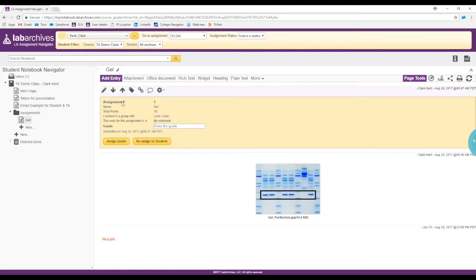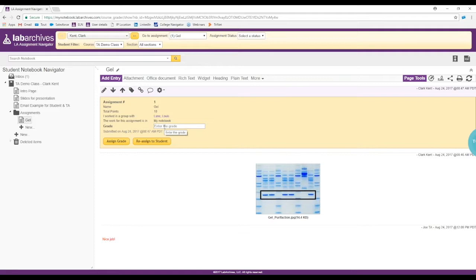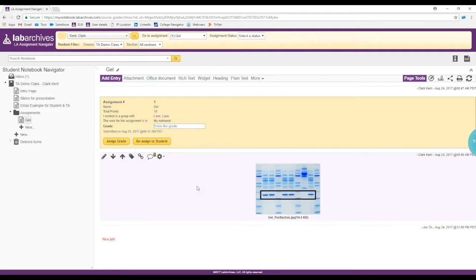This is assignment number one, called 'Gel,' worth a total of 10 points. You can see that Clark Kent worked in a group with Lois Lane, so you have the opportunity to put in a grade for Clark Kent. It looks like he did really nice work, so on your screen go ahead and type in a number from one to ten, give him a higher number, and then click 'Assign Grade.'